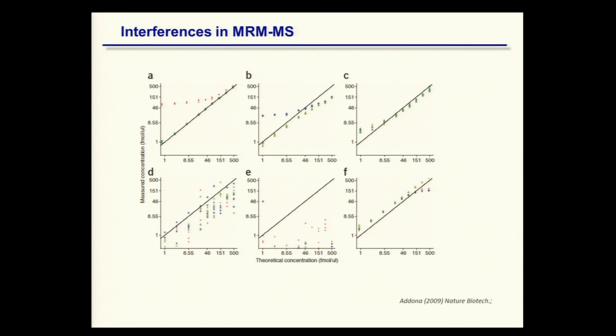Years ago, we used to do this manually, and in fact, this is a very tedious process. There was a study where it took 3 of us 2 weeks to go over data from 7 different sites, and that was only 10 peptides. Right now, our multiplexing capability is much higher. We're looking at hundreds of peptides, so it's impossible to detect and avoid the interferences manually.